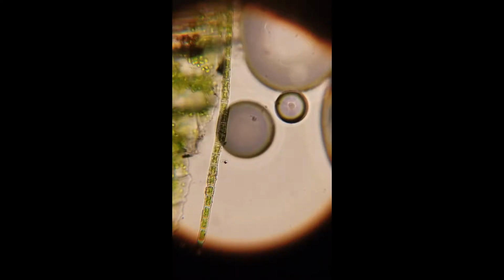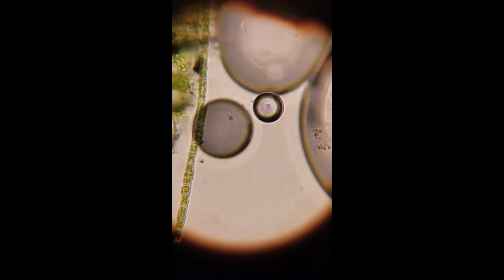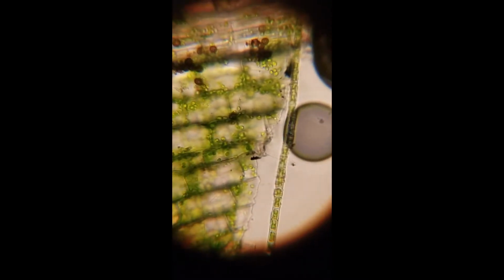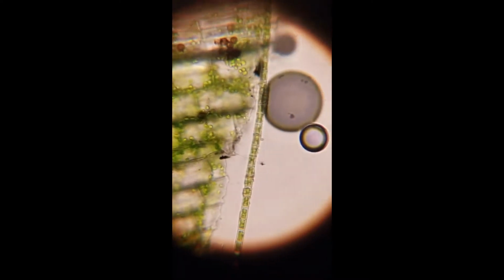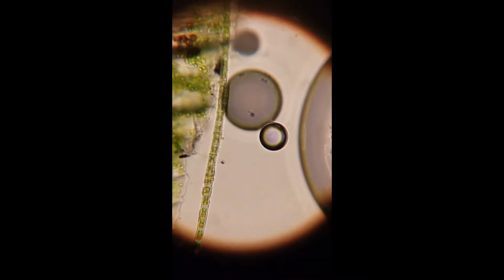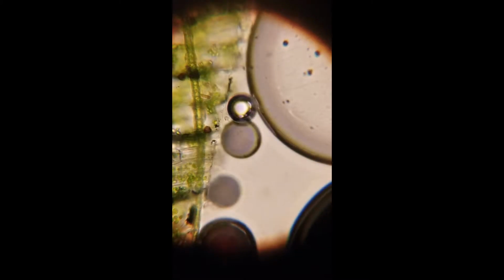Here I'm looking at a cut part of a leaf. You can see all of those chloroplasts working away with their chlorophyll green. They are producing oxygen bubbles. They are using the sunlight to do some chemistry, and that chemistry is making sugar and oxygen. Now oxygen is a gas. It's producing these air bubbles as we're watching it under the microscope. Well, not air bubbles, rather oxygen bubbles.